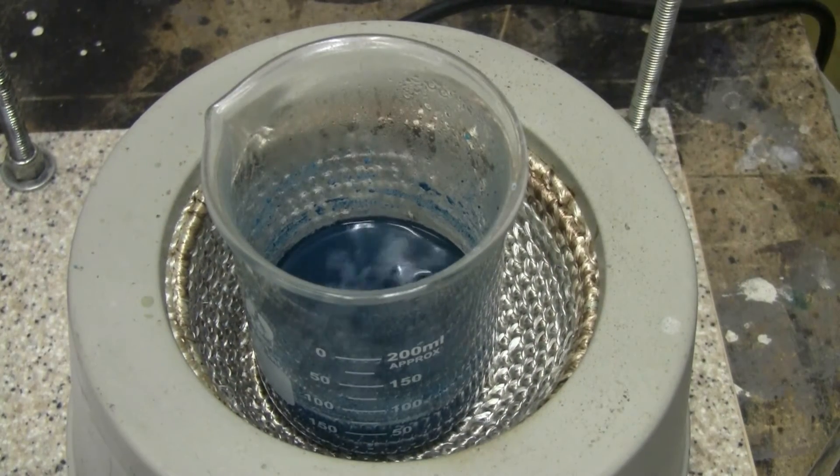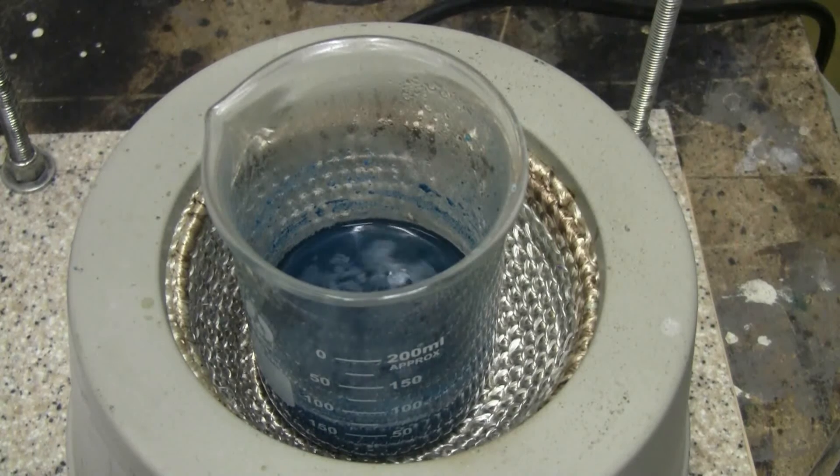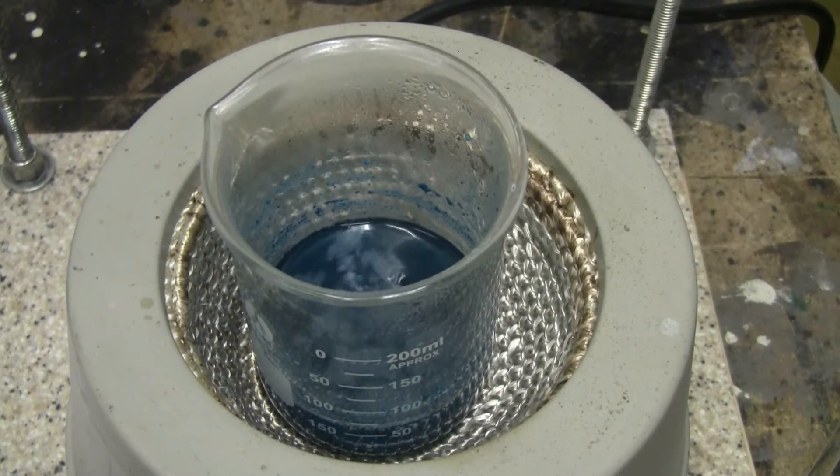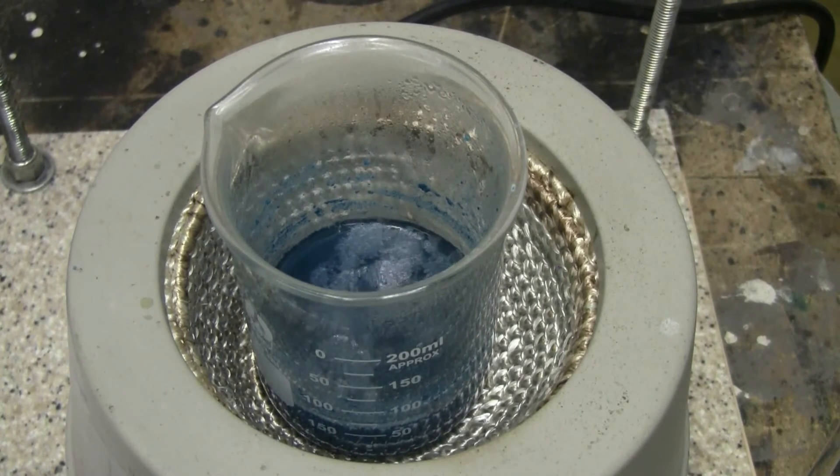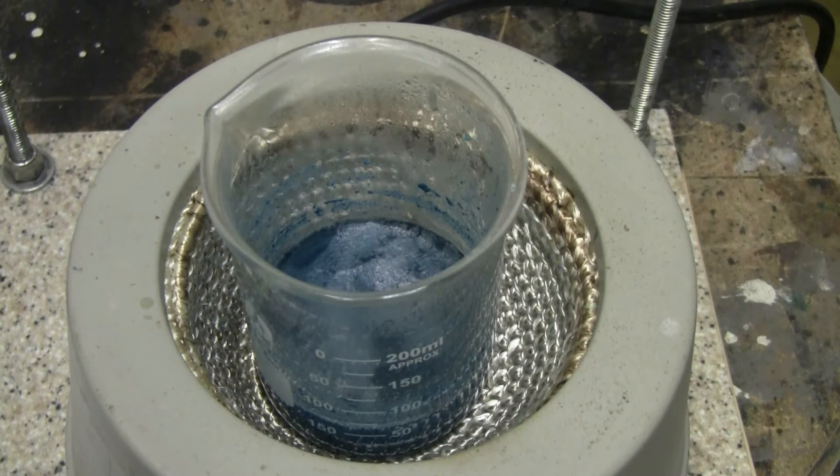About 15 minutes has passed and the mixture has finally stopped fizzing. No more CO2 is being evolved and there's clearly a dark blue precipitate of copper aspirinate in here. So I'll switch to filtering the precipitate off and then wash it with isopropanol to remove any excess unreacted ASA.